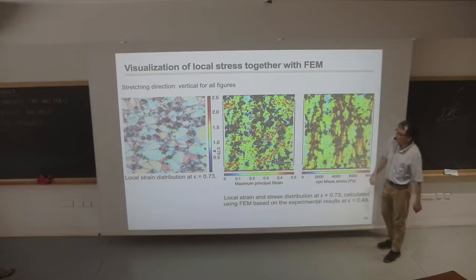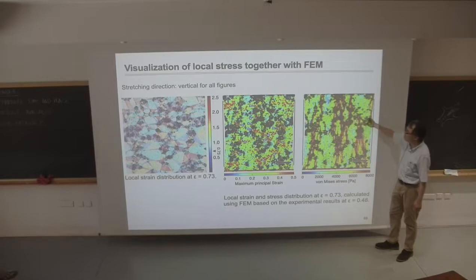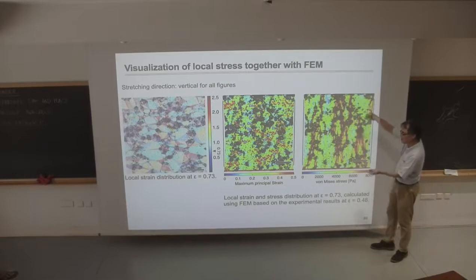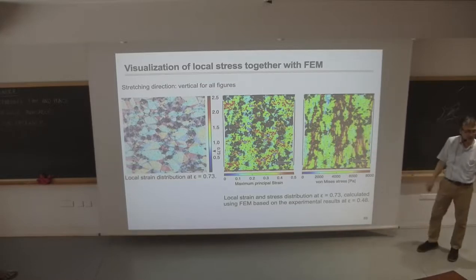Okay, and then we look at the stress map. It looks different. It looks like the high stress part, which is the red part in this picture, is sort of connecting these aggregates and trying to form a network. So it's like a stress network in a sample, and these rubber domains don't do anything. They just don't do anything. When you stretch, the force is supported by this network of stress. So you can actually visualize how the force is distributed.